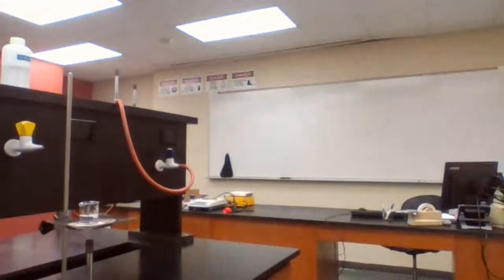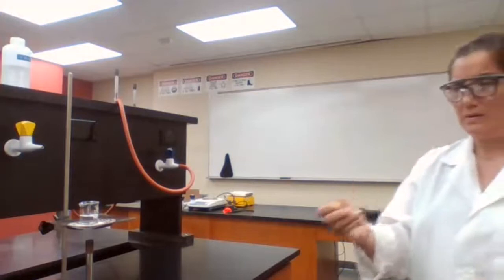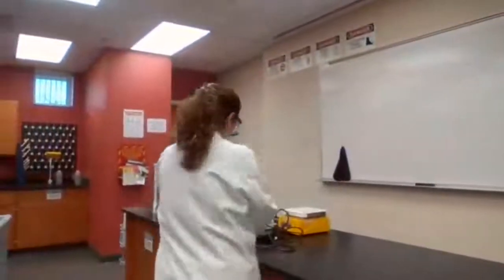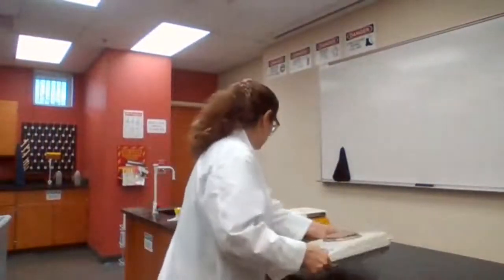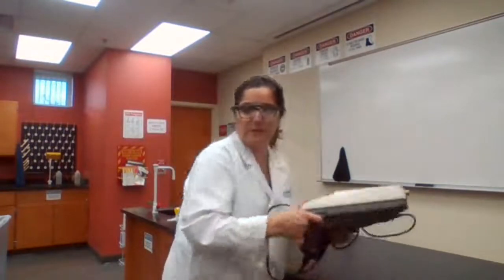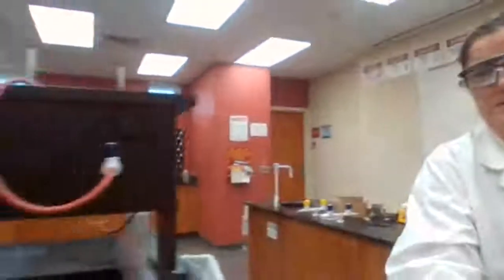Okay, for 11, we're going to measure the mass of the object. The object that I'm using is object number 14. You need to know the object number, and we are going to place it on the scale. If it's not connected, I can bring it here. So I have everything on one side of me.